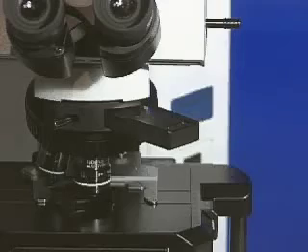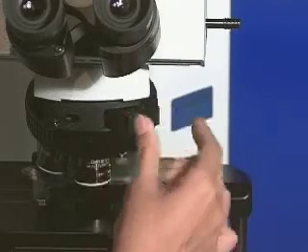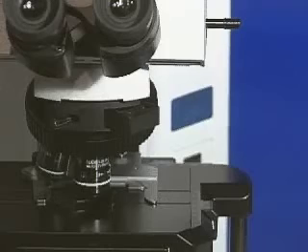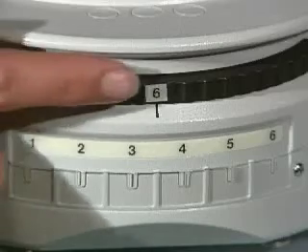Remember, prior to turning on the EXFO, ensure the emission filter is in place. At this point, you will now want to turn on the light source. The position of the filter may vary depending on the configuration of your microscope — the filter may be in a filter tray or a filter cube.